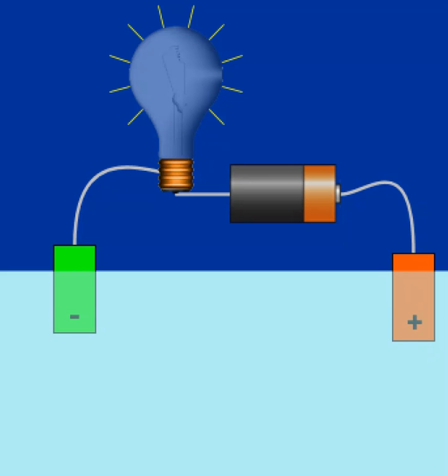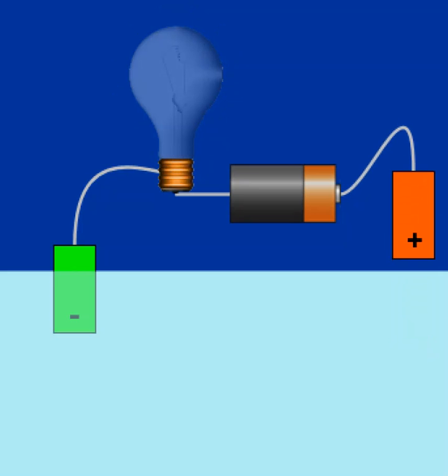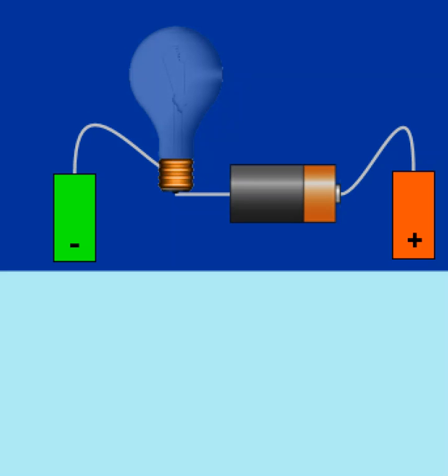Okay, next we're going to do glacial acetic acid. Now, acetic acid is in your notes as being a weak acid. That means that when you put it in water, it does not totally ionize. Most of it will stay in the molecular form, and some of it will break apart into the ions. So you might have an idea of what it'll do as far as conducting a current based on that.